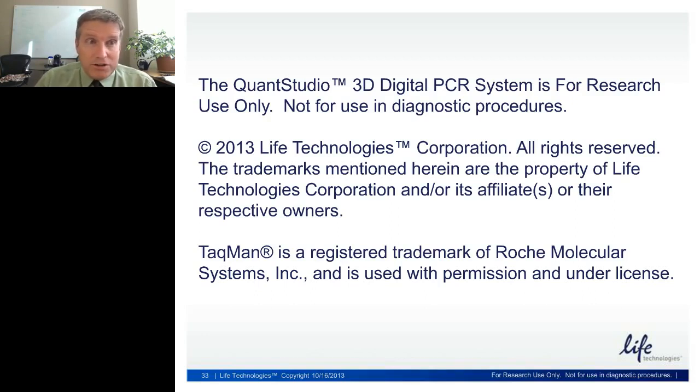The general answer is yes, the technology can be applied to molecular beacons. Specifically as applied to our system, the answer is probably not, but that doesn't mean it's not open to developmental pathways in the future.